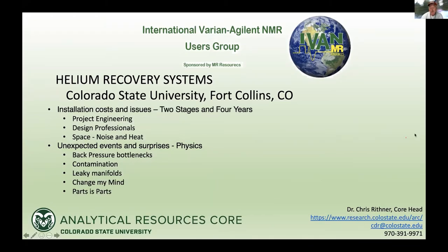The biggest problem, they were asking us about our experiences, was project engineering, finding design professionals that can speak with Quantum Design. At the time this was fairly early. I think Quantum Design is a little further along now. And then you have to worry about space, noise and heat. How do you manage that? These things are quite noisy. We use a liquid coolant system for ours in a facilities provided plant. Unexpected events and surprises: back pressure bottlenecks, contamination, leaky manifolds. I changed my mind about what I wanted to do several times.